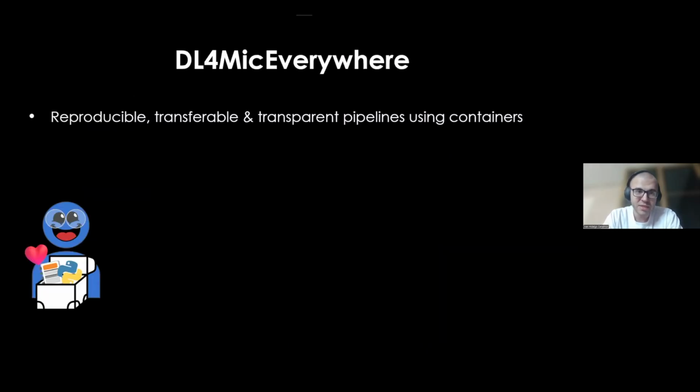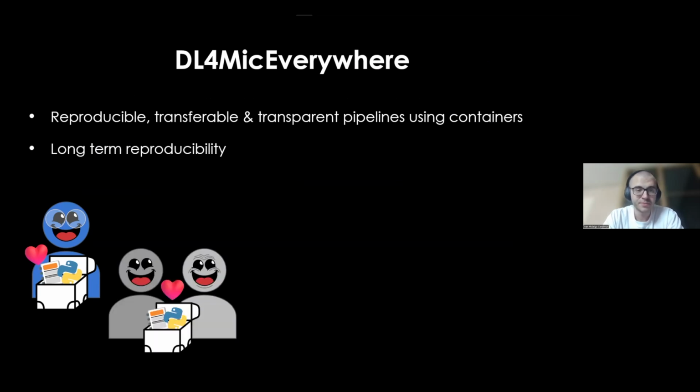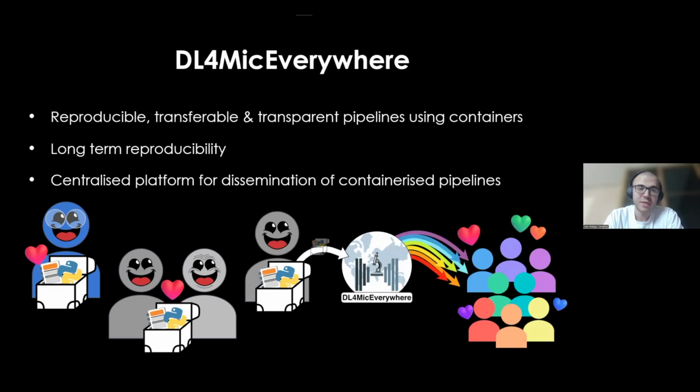So at the end, as a summary, DL4MicEverywhere brings reproducible, transferable, and transparent pipelines, which are notebooks using containers. It brings long-term reproducibility and is a centralized platform that allows you to disseminate your pipelines.